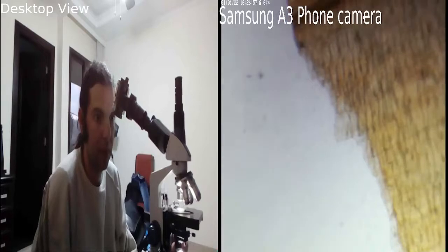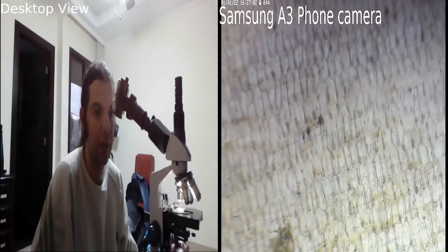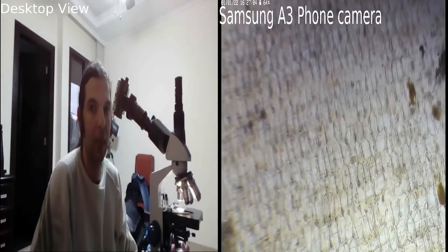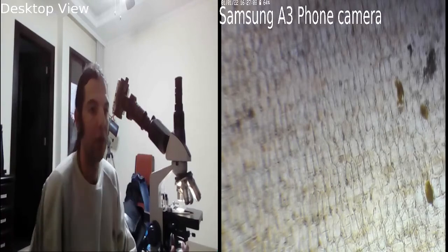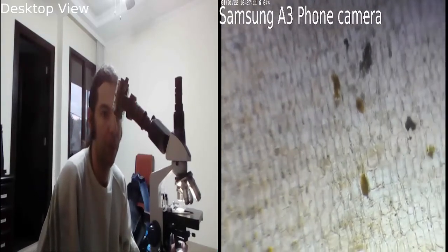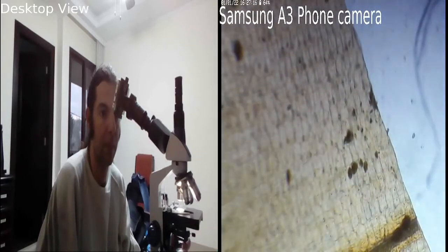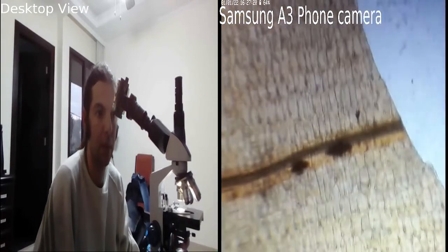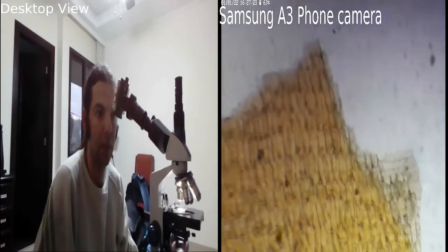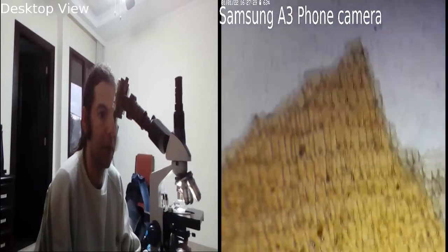And ta-da! Just see everything on this onion leaf. I've made a tilt in the phone in order to catch the whole view. And that's it.